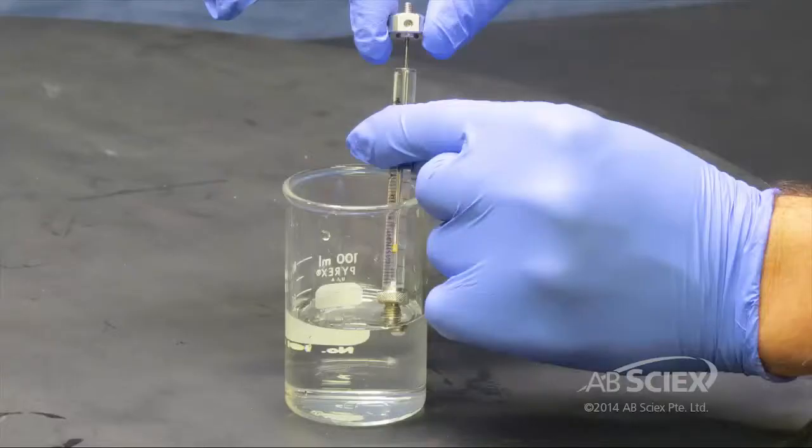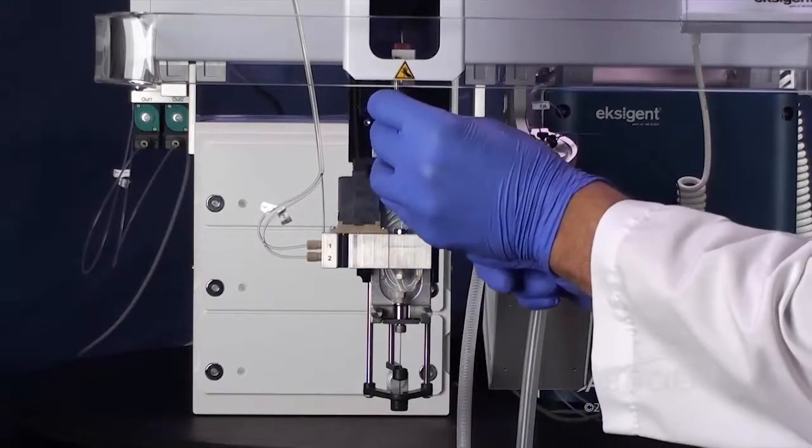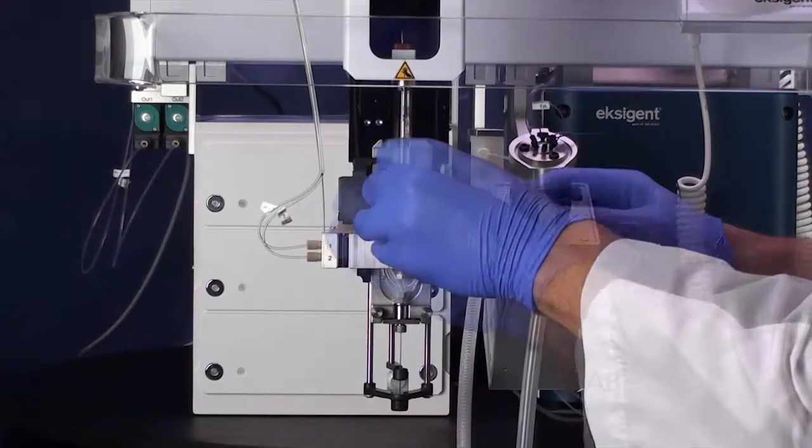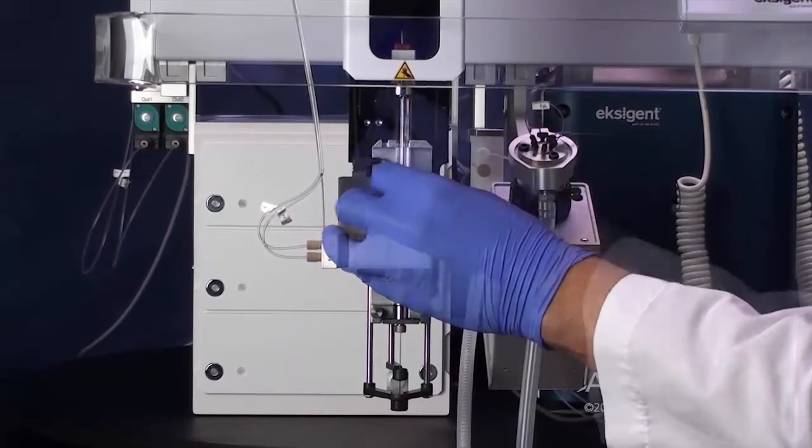Prime the new syringe manually before inserting into the PAL system. Screw the syringe barrel into the holder. Move the plunger holder up until it reaches the plunger bushing.